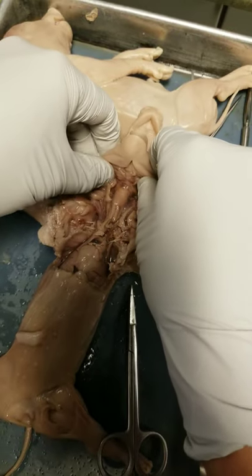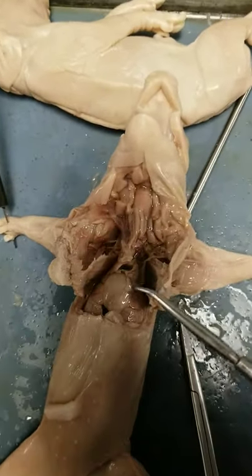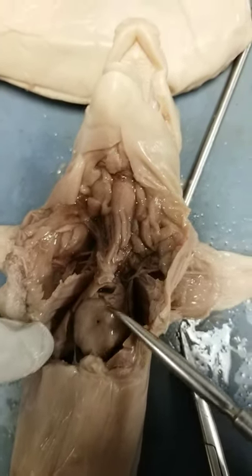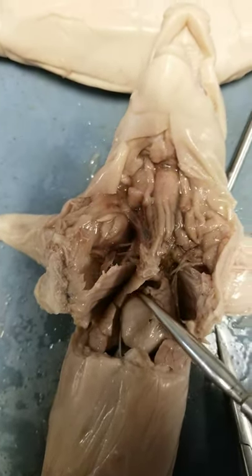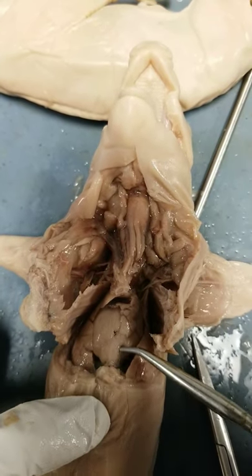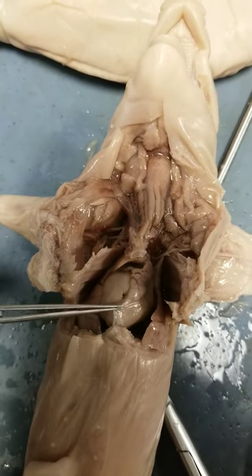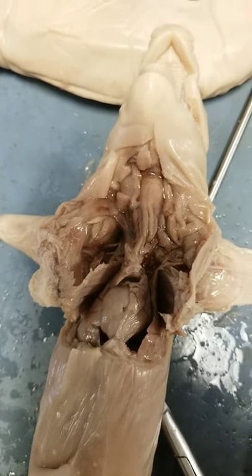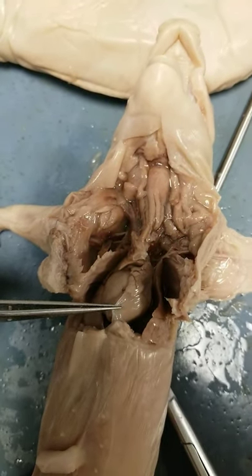We'll make a few more cuts in a minute. What we can immediately see is a very large, dense organ right here — this is the heart, right in the center of the chest. The flappy things on either side are the lungs: this is the left lung and this is the right lung. You can see the heart is covered by a thin membrane — that's the pericardium, the serous membrane that surrounds the heart. It lubricates the heart as it moves, since the heart is pumping all the time and you don't want friction.